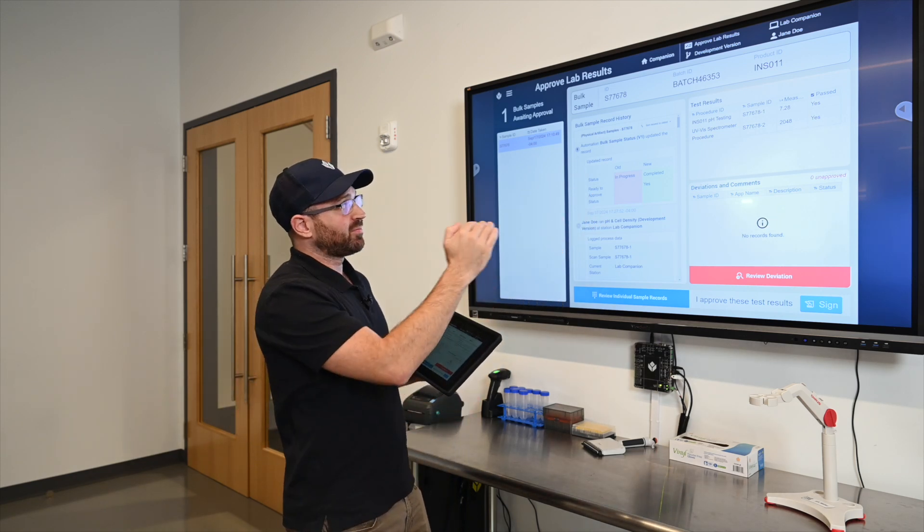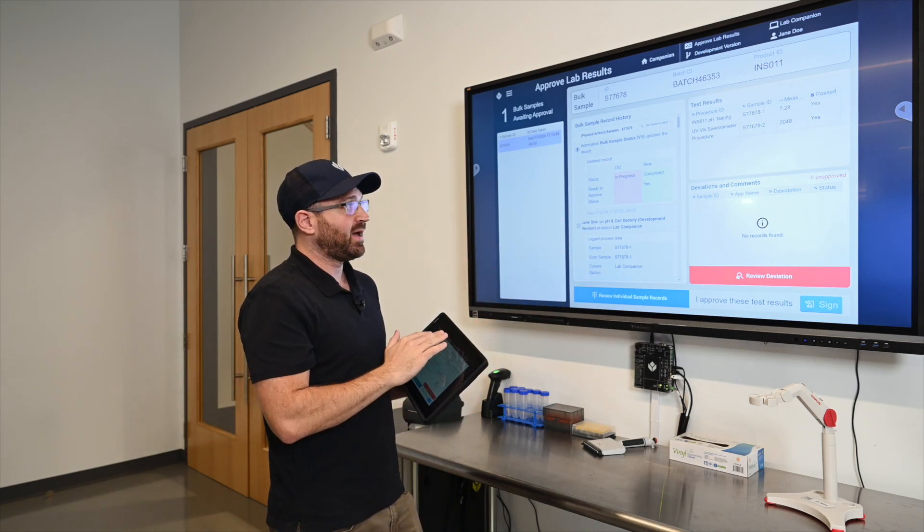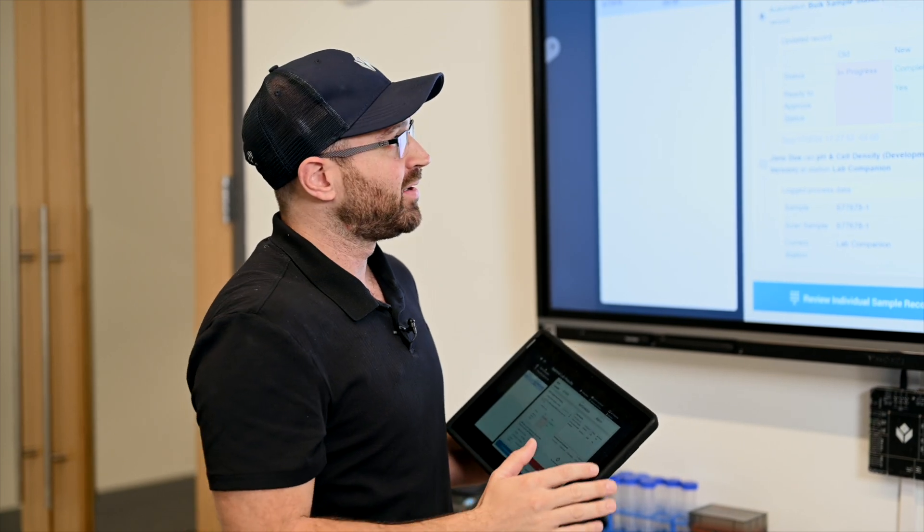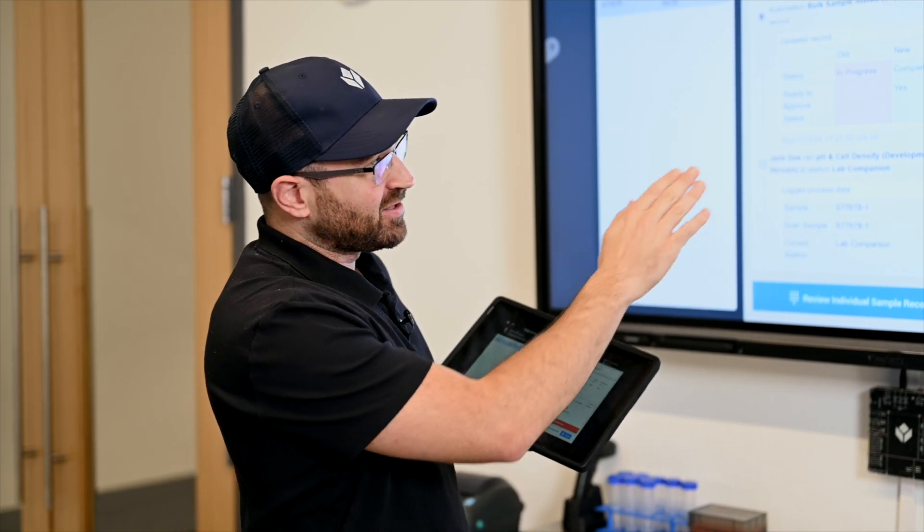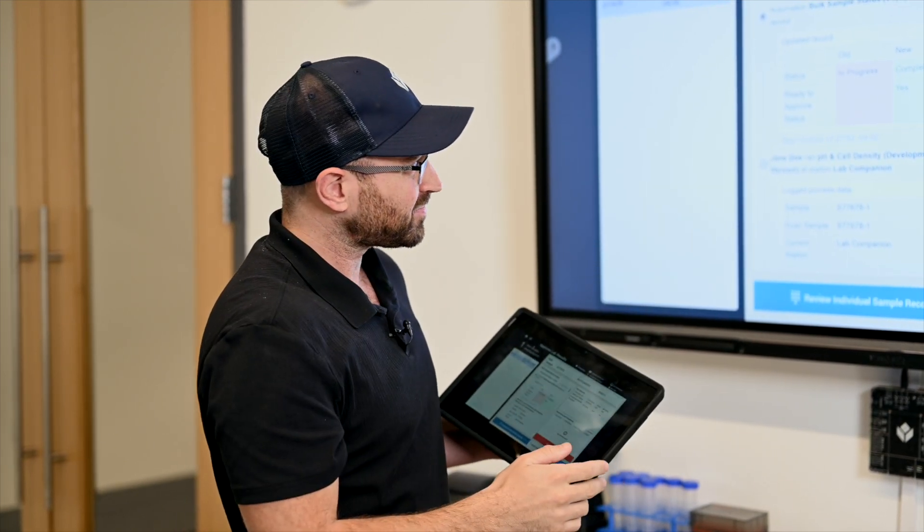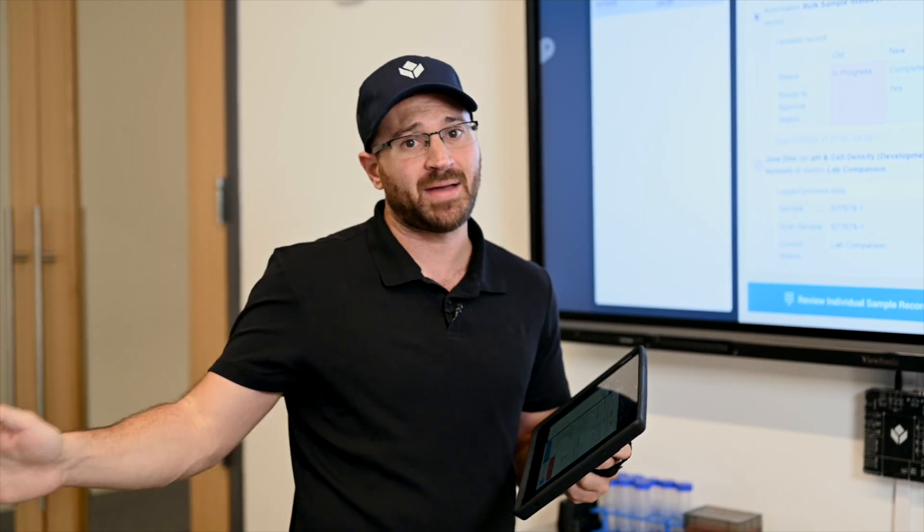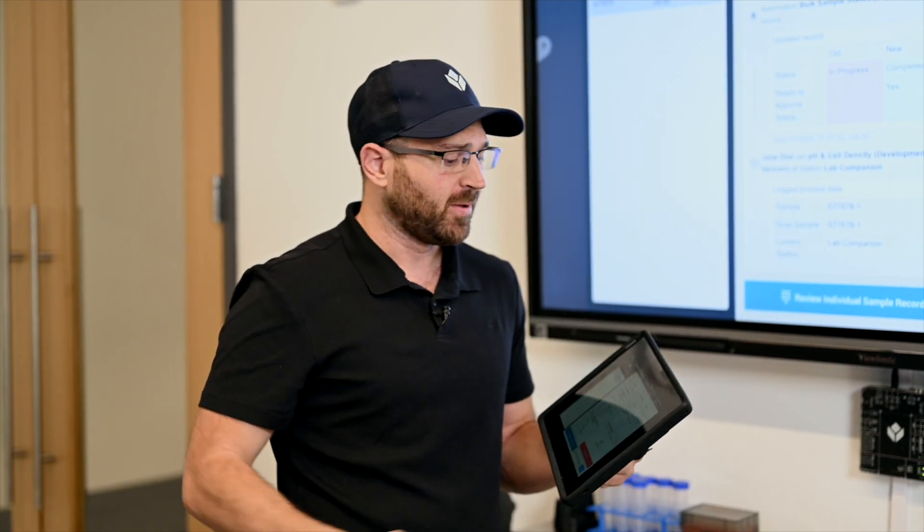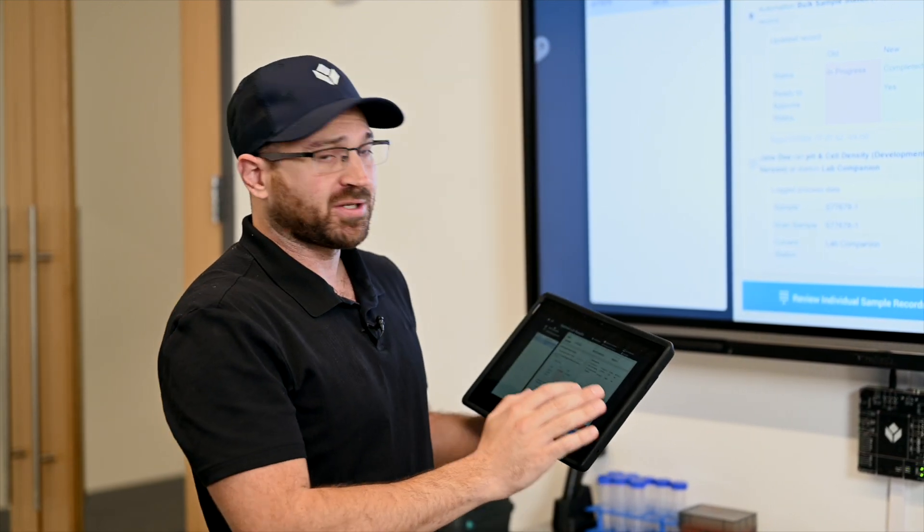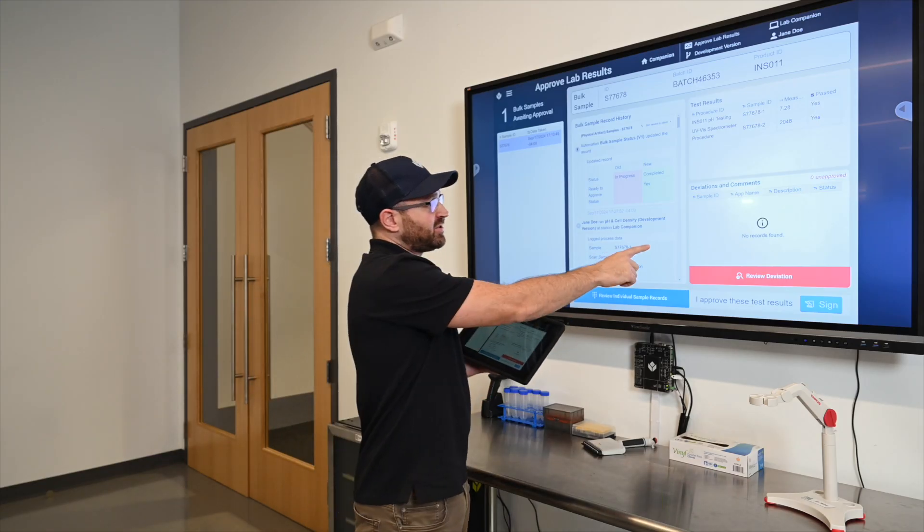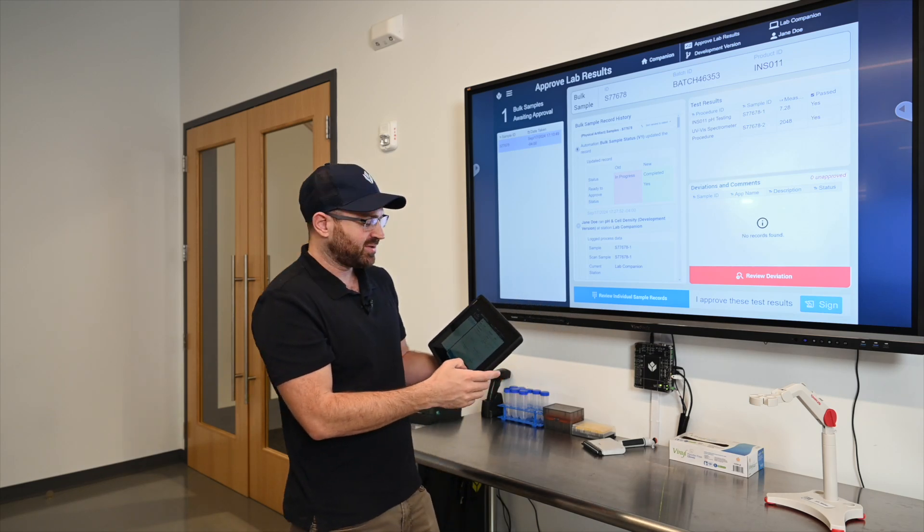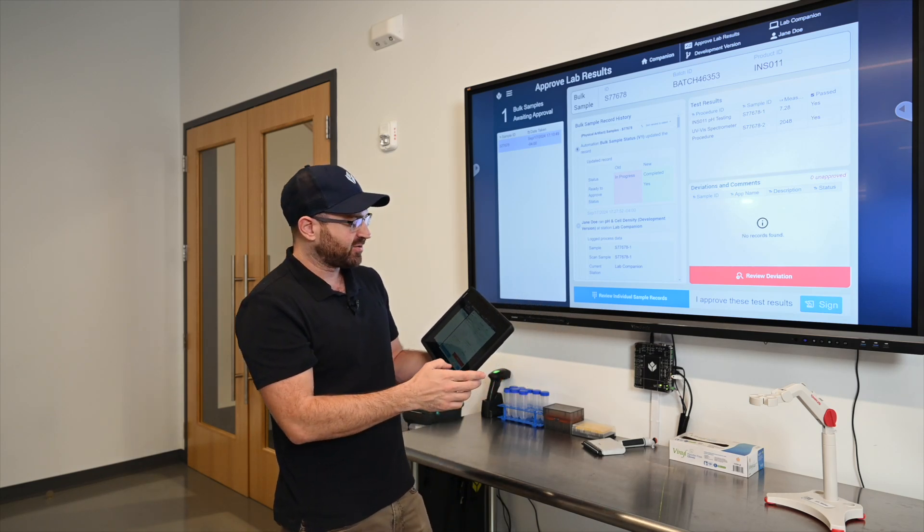For this simple example we're just showing our test results. We can highlight any information from any part of the process. Maybe we took multiple test results, maybe we had retests we wanted to do. In this case we just have these two simple results I shared with you. And before these results can be sent back to production we have to actually approve of these.